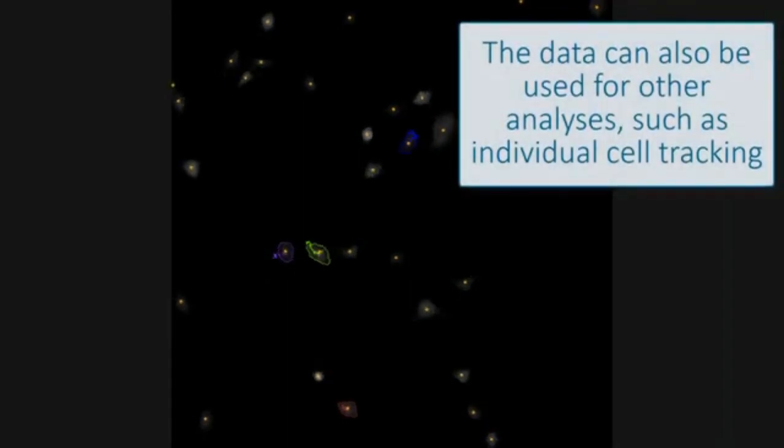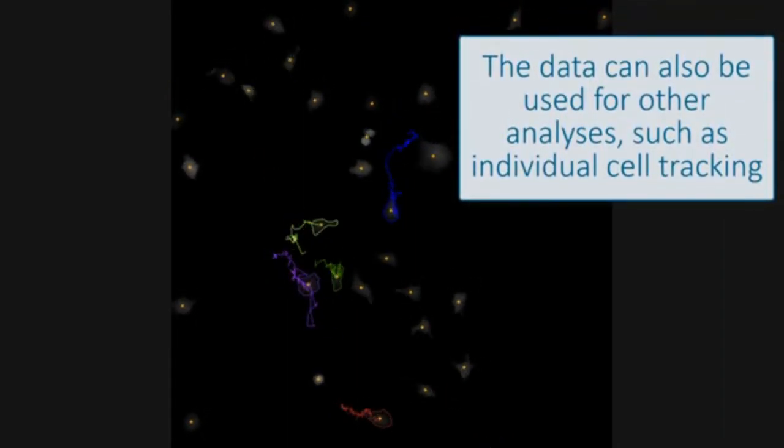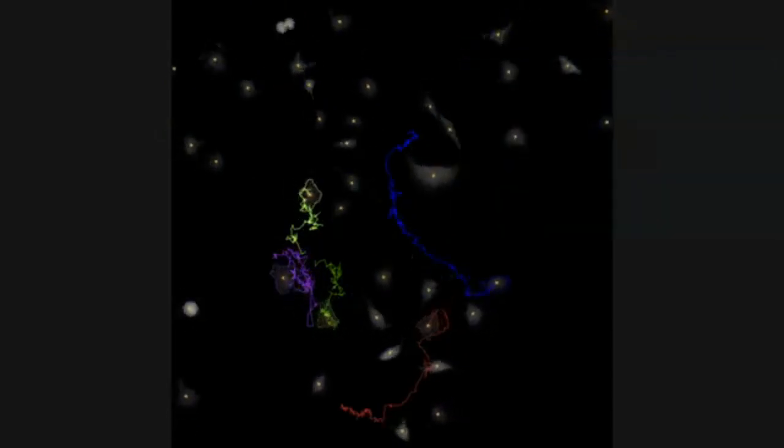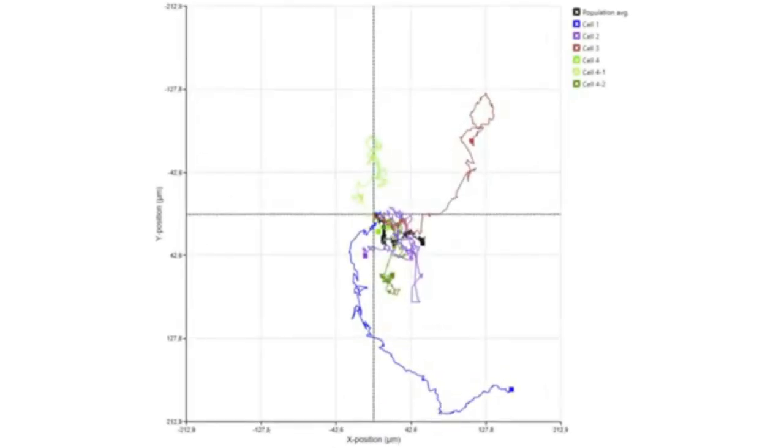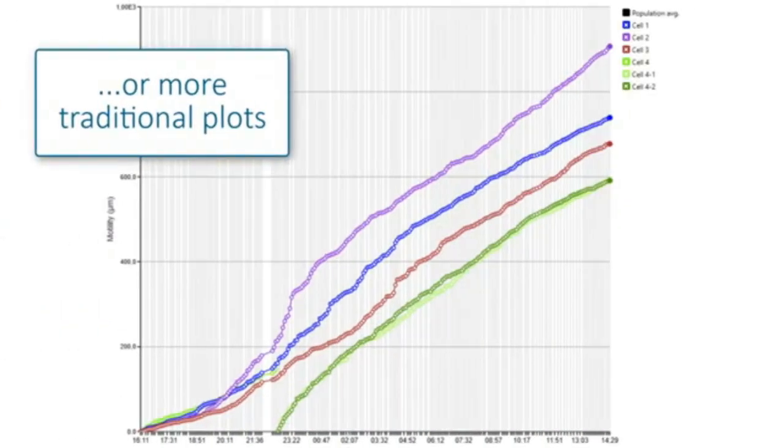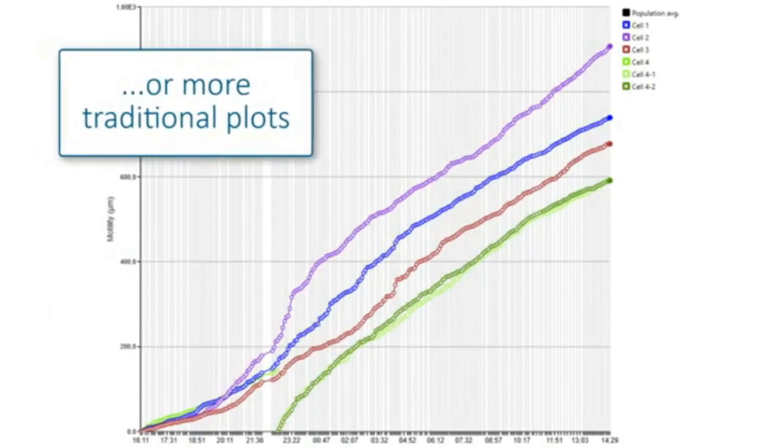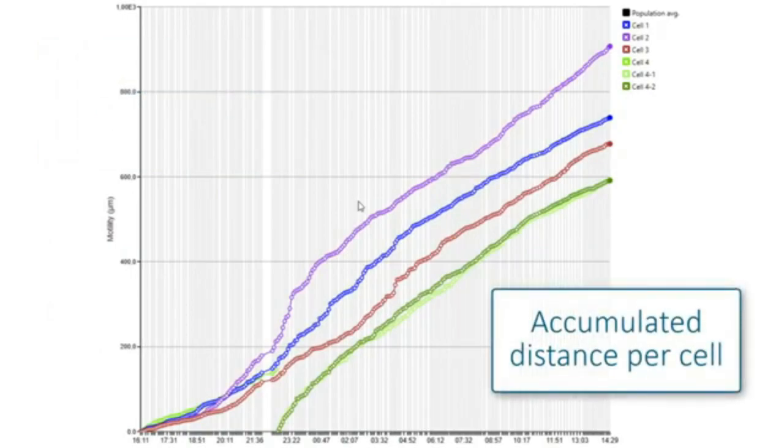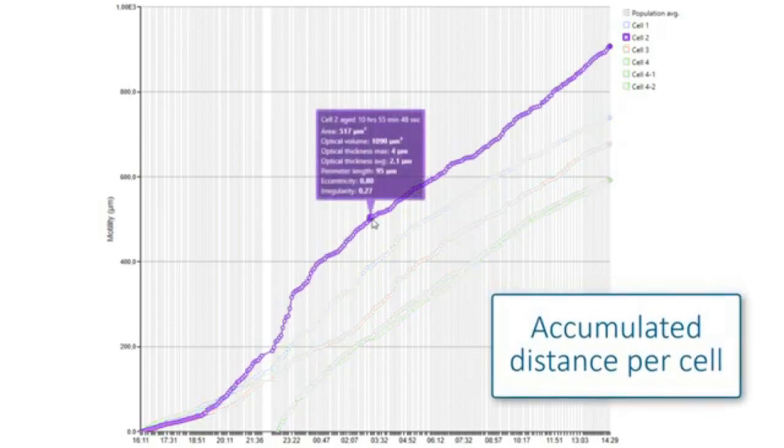The images and data from one experiment can be used for other analysis as well. For example, you can track individual cells. The software generates a cell movement plot. You can also get a more traditional plot where any parameter can be plotted against time. Here, the accumulated distance traveled by each tracked cell is shown.